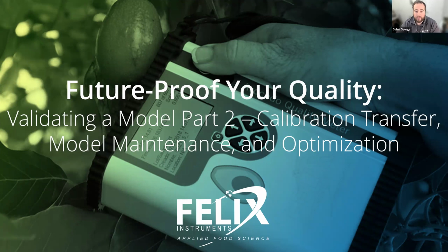So today we are wrapping up our series on chemometrics. We've had 4 other previous parts to this that have all discussed the varying components that go into building a model or a calibration for a near-infrared spectroscopy-based device. And there's a lot of components to it.